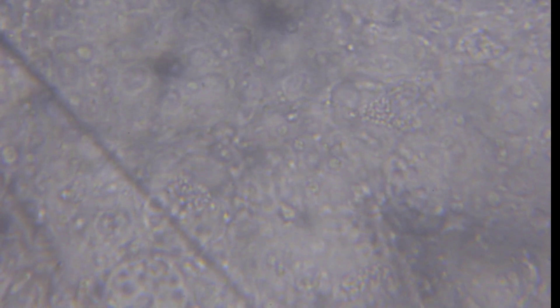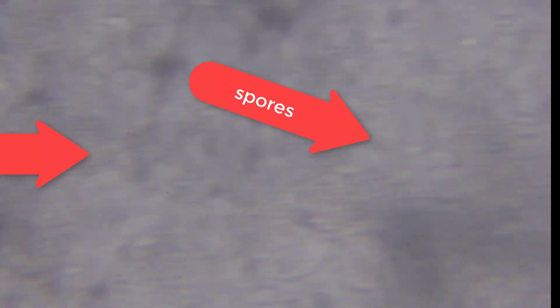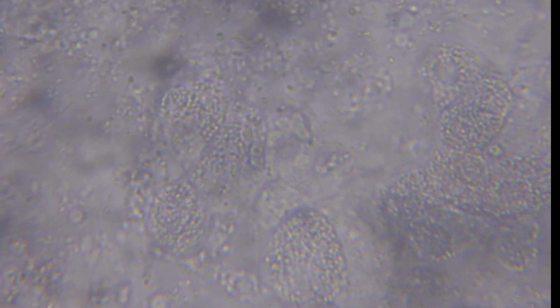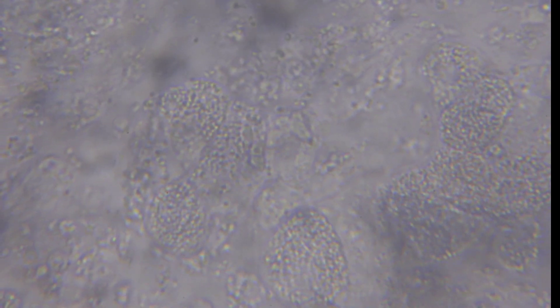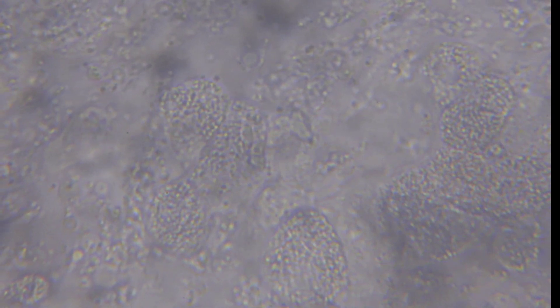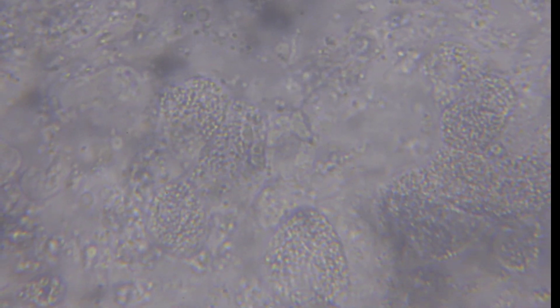If you find shrimps like this, it is better to harvest. If you do real-time PCR, it may be positive at 14 Ct — indicating a very high number of spores. All the spores are uniform in shape, making them easy to identify. You should also be able to differentiate EHP infected cells from normal cells, and that is very easy to do.